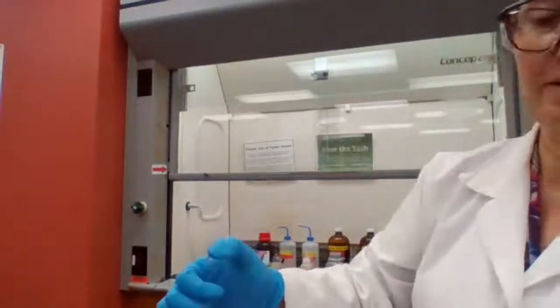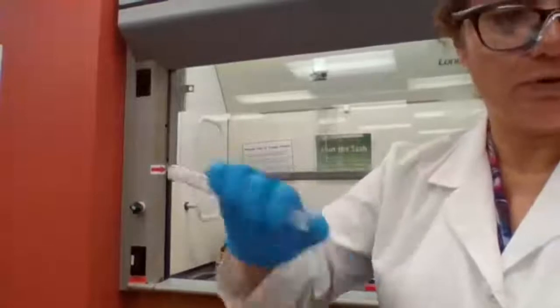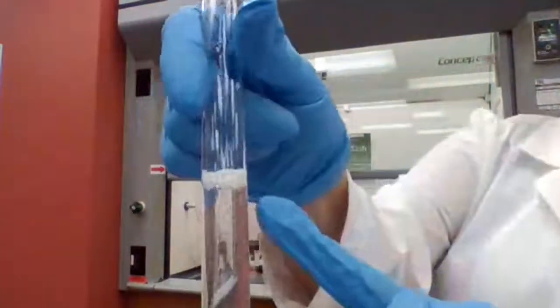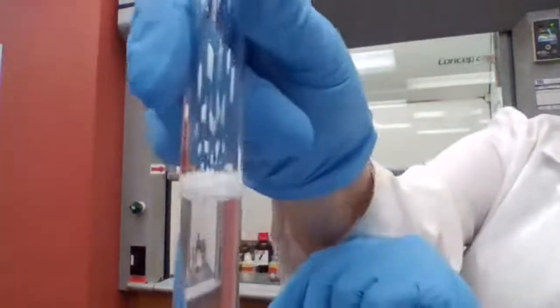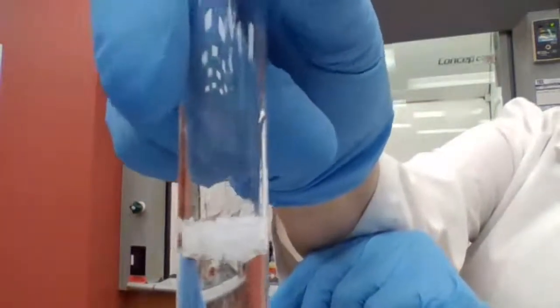To go back to experiment 18, when I was talking about solubility of carboxylic acid and the reaction I had on the board for you, I said if you mix it well and you hold it, you might see formation of bubbles. You see those bubbles are forming now actually. Okay, the bubbles are forming. That means it is reacting.